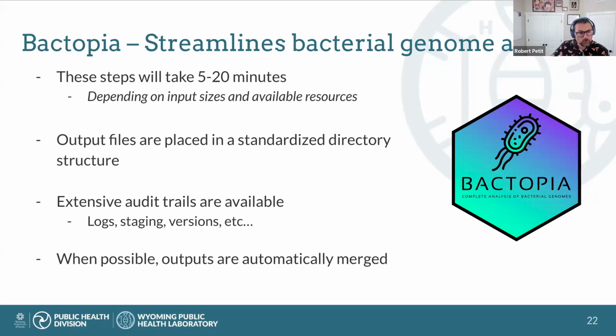But when it runs all these steps, it puts all your output files into a standardized directory structure. And this is quite useful for what happens next. In these outputs, you get an extensive audit trail. So anything you might be interested in, logs, staging information, versions, all that fun stuff, you have all that available to you. Oftentimes, that's something we look at when there's an issue. But no matter what, they're always there for future use.